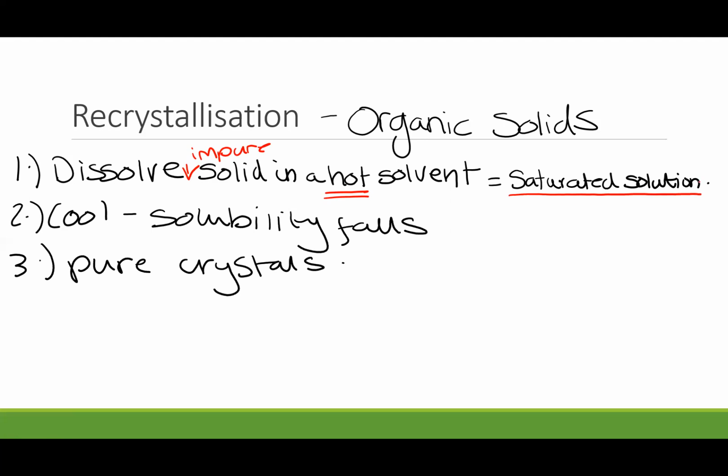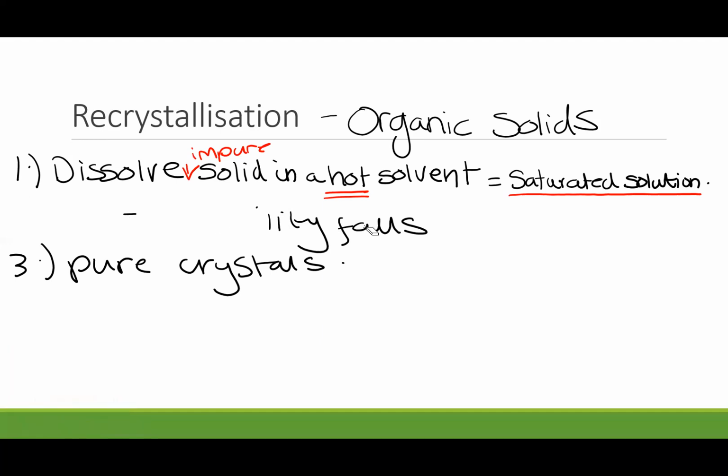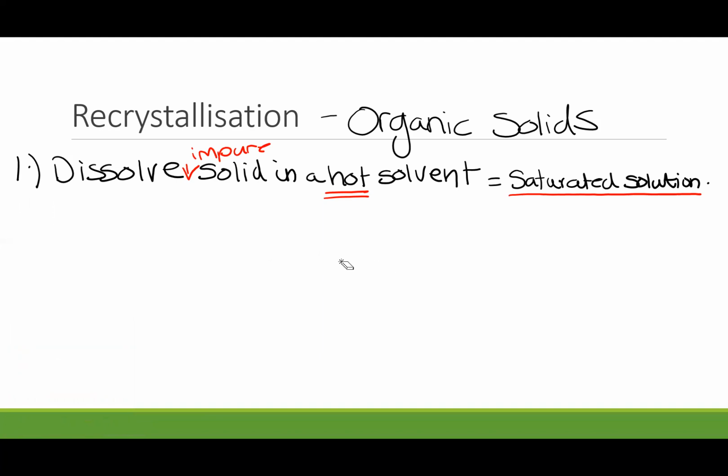We're going to filter, so I'm going to actually add on another stage. We are now going to filter the hot solution through a heated funnel.